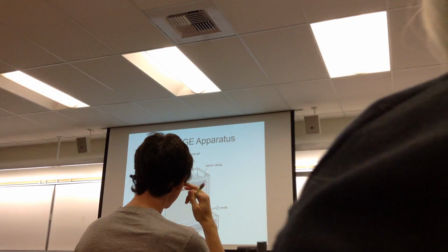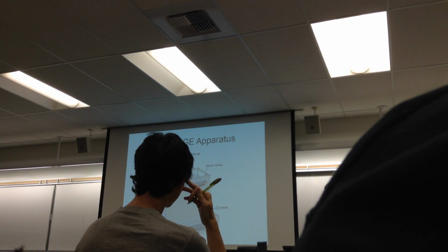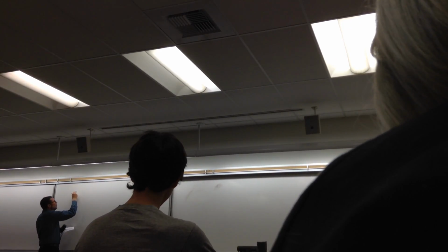Actually, before we do this, let me get our outline going and introduce this a little bit. So we talked about absorbance at 280 nanometers due to the aromatic amino acids. The second way of detecting total protein, just to get it down, is the Bradford assay.